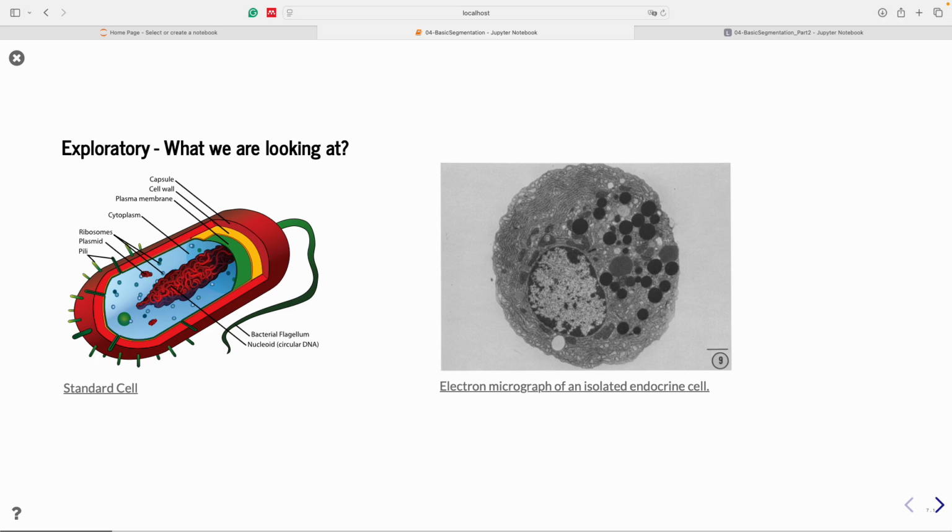In some cases, you have a long history with that kind of images, then of course you know, okay, I need to get to these different parts here. Actually I'm not a biologist, so I can't tell what the cell components are, but anyway, you know that you want to identify specific shapes in this image, and then you can do the analysis more directly, and then you can start making a hypothesis on how the cell is growing.